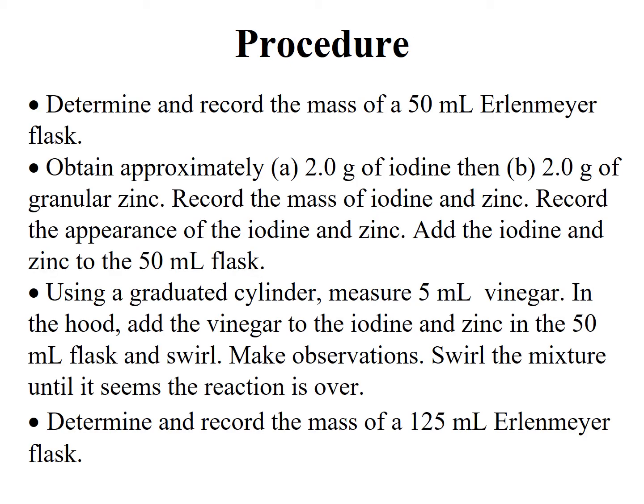So I want you to watch the videos that were posted related to this experiment, because some things from that video are needed to answer some questions that are part of your lab report. So if we're going to follow the procedure based on the manual, this is what we have.